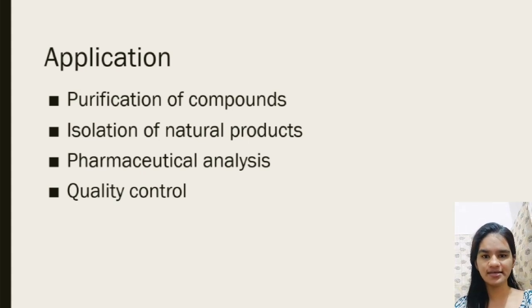Now let's see the applications of column chromatography. Column chromatography is mainly used in the separation of compounds, isolation of natural products, pharmaceutical analysis, and to control the quality of the compound.